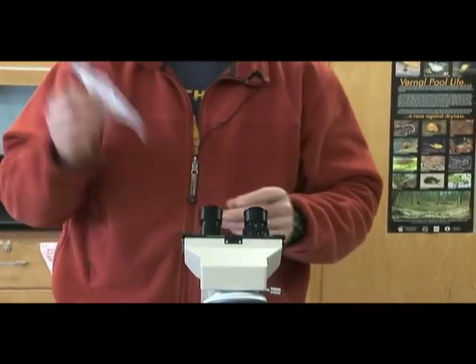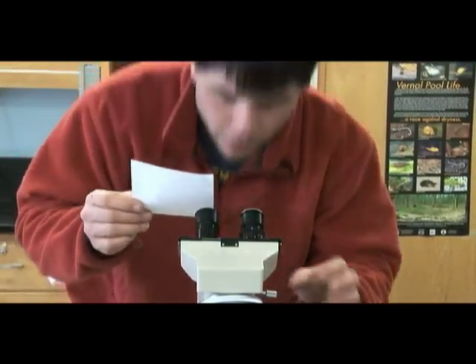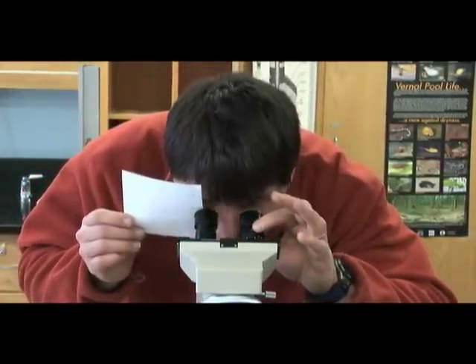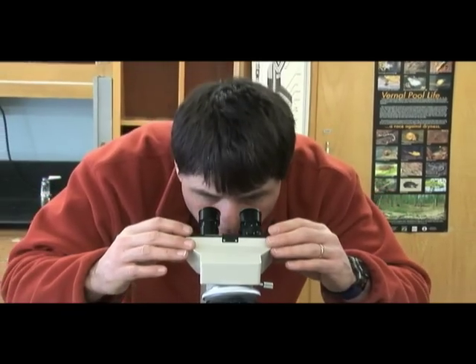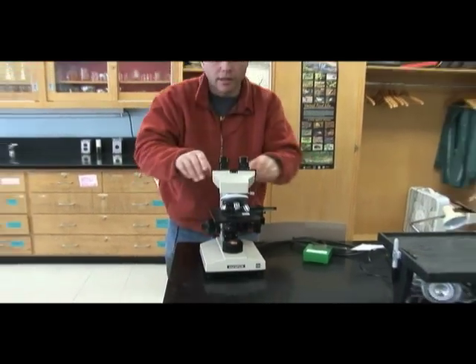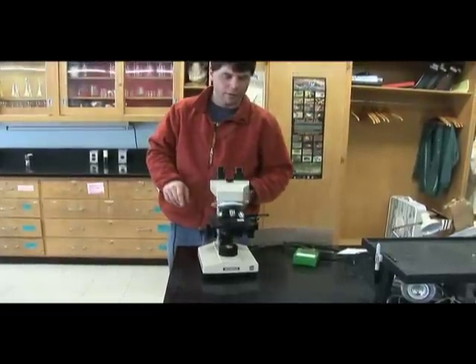Covering the left eye, then, I look in and focus my objective on my object. When I see that, I move to the right eye and look in, and this time I use the diopter. And when I have them both clearly in focus, I make sure that my interpupillary distance is correct and take note of the number. Okay?